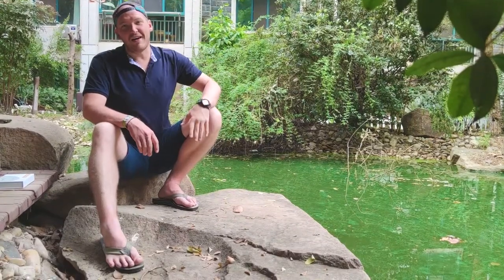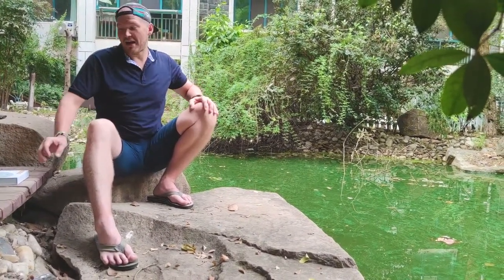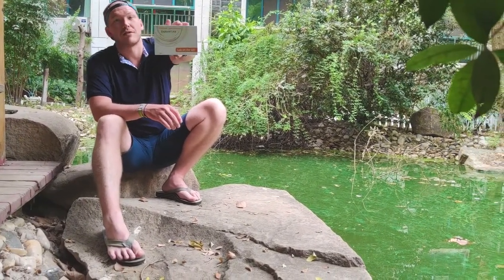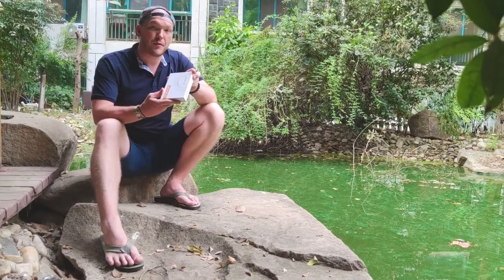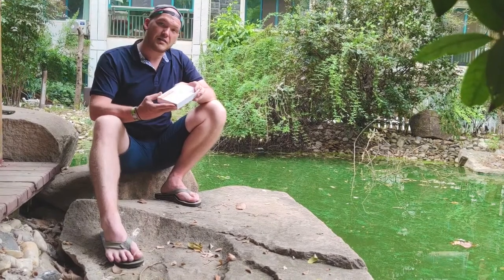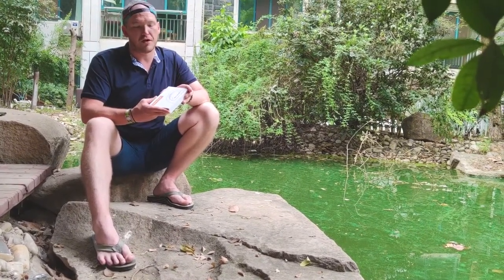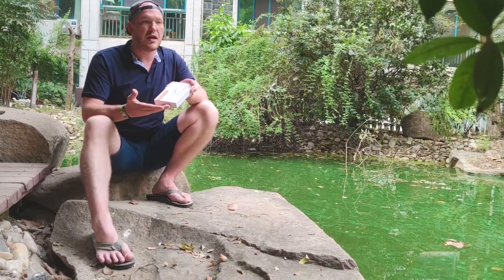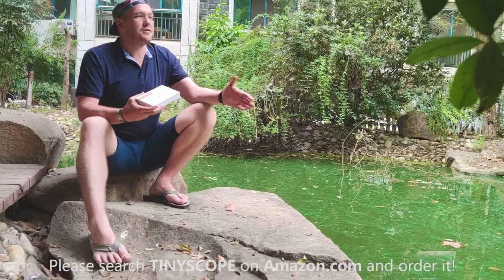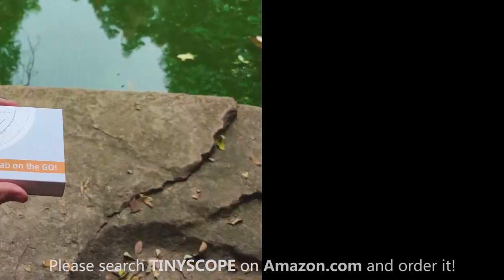Hello everybody, Misha here again. Today we're introducing our latest Tiny Scope — our newest edition, the Tiny Scope Explorer's Kit. This is available for purchase on Amazon right now, you can check it out after the video. The Explorer's Kit is the upgraded version of our original microscope set, and this version allows you to take liquid samples. We're out here at this pond today to do that, so let's dive in and see what we can find.